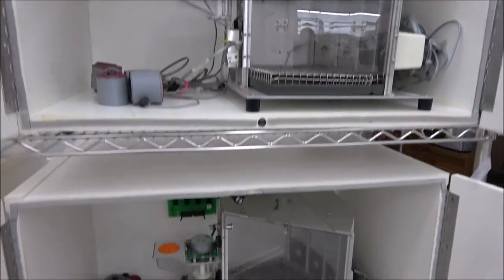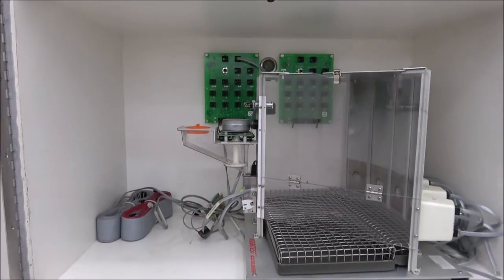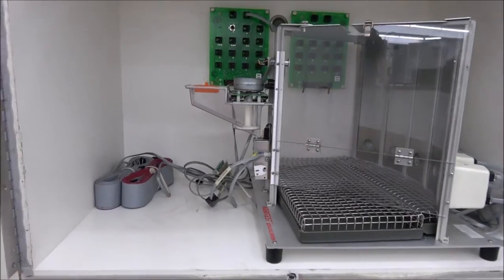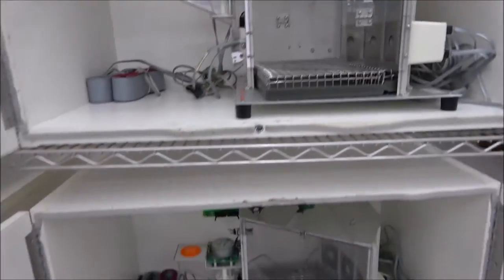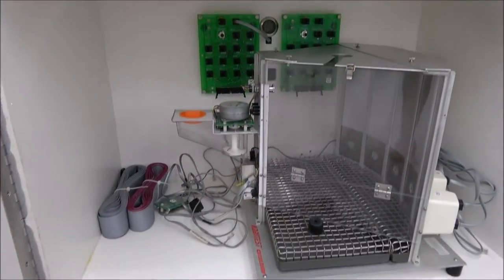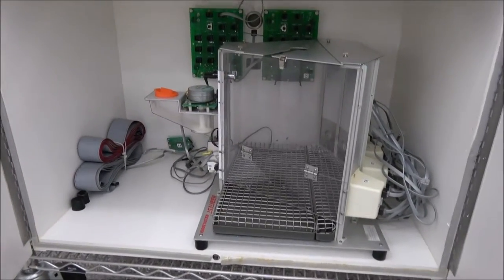Our tech department has thoroughly gone through this system and ensured you that everything works fine. Our cleaning department has gone through and cleaned and sanitized everything, so this is definitely ready for your experiments.